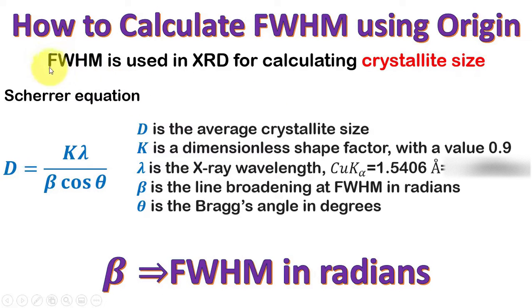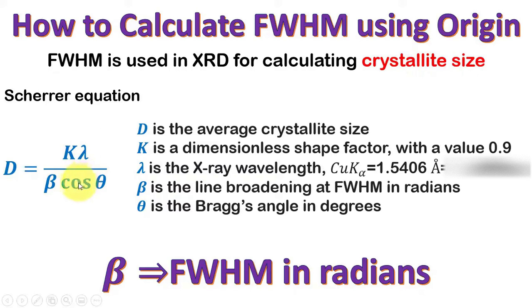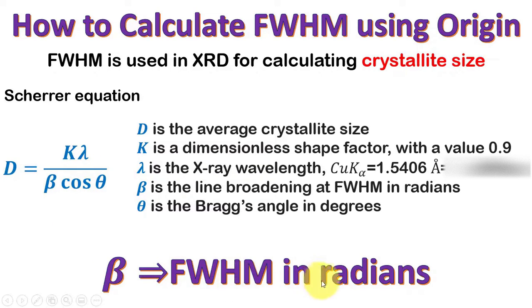by using the Scherrer equation. In this equation here all other parameters are available except the beta, which is the full width at half maximum in radians.